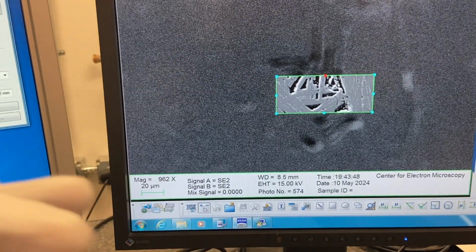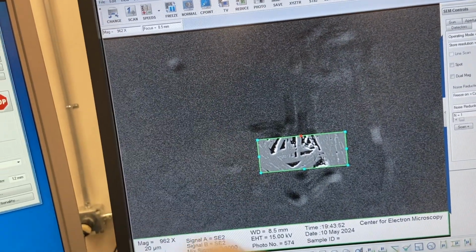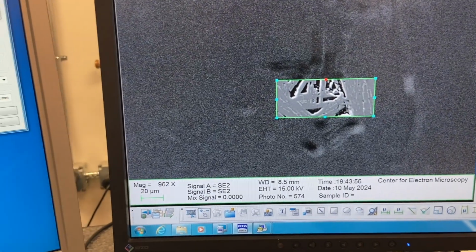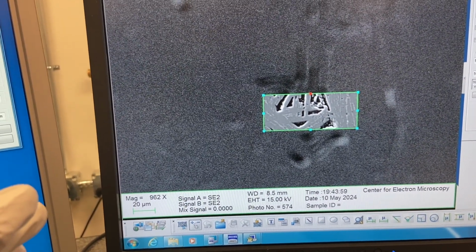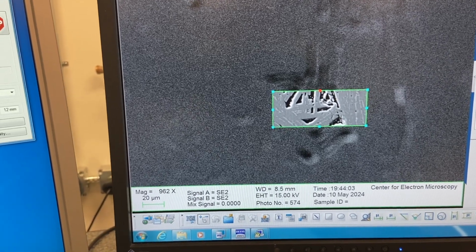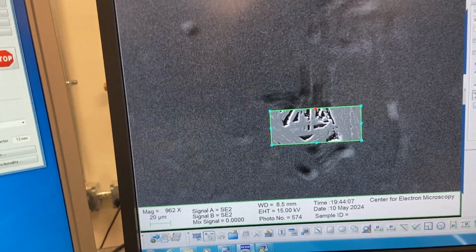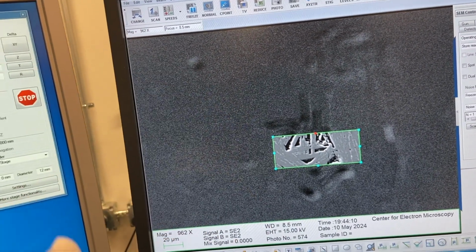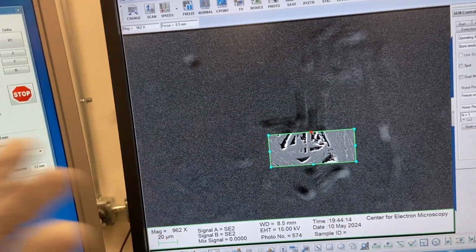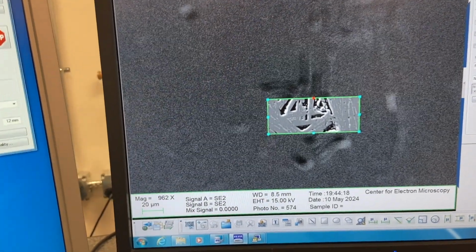But in the case that they do knock off electrons from inner orbitals, electrons from a higher shell go to fill in that hole, because essentially you want to get back to the ground state. I think it's called an excitation state, and so you want to get back to the ground state of where those electrons are. By doing so, an electron fills in the hole of the orbital that initially an electron was lost from, and so you produce an X-ray as a result, which is characteristic to what kind of atom you have, and that's essentially how that works.